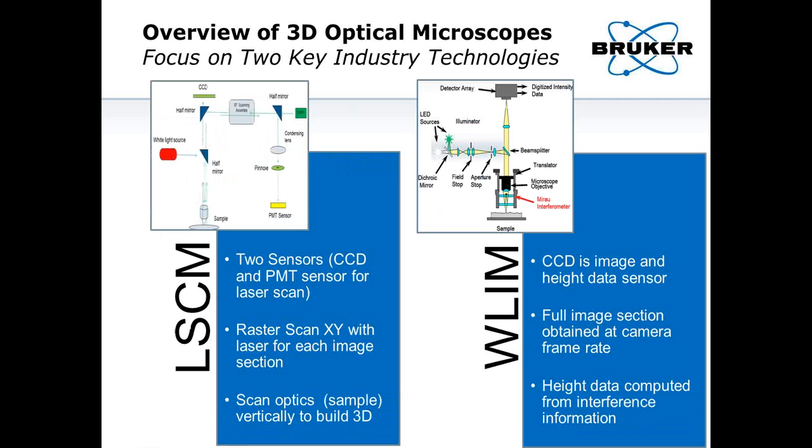So as I said, we spend a little bit of time focusing on two of the key technologies. On the left-hand side, I made a simple diagram in the top that shows the elements of a laser scanning confocal system. You can basically see there's three bullet points there that are kind of important. I think there are two.